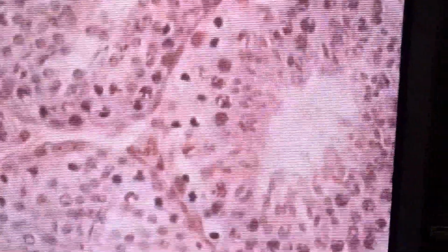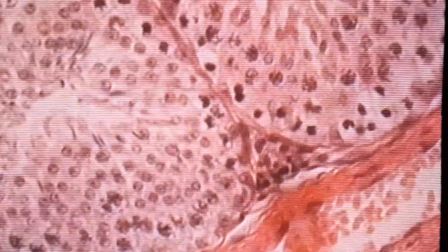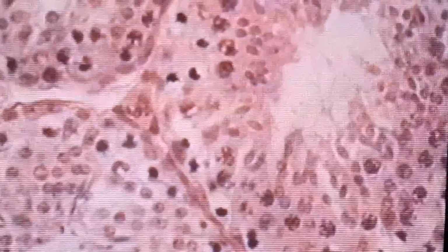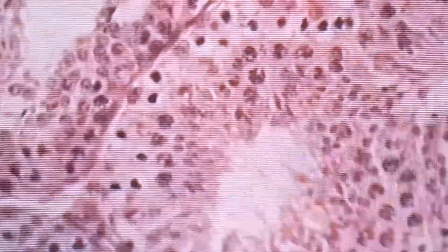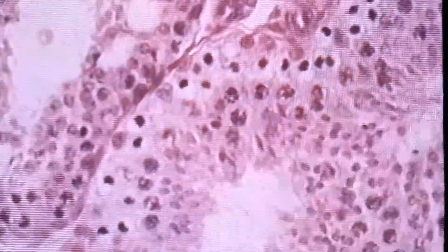Can you show us secondary spermatocytes, in context of primary, of course? Well, that's where it's hard to do. No, those are spermatids, right? They look more like spermatids. They're a lot smaller. Let me just tell you, I won't ask you about secondary spermatocytes. Those are hard to differentiate.